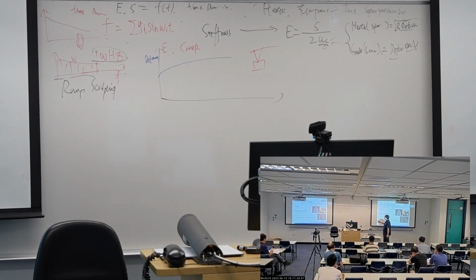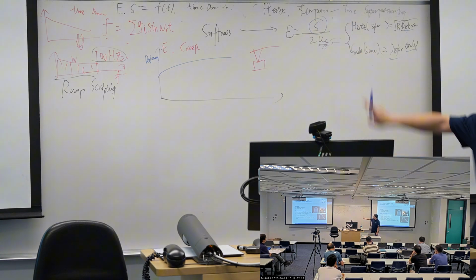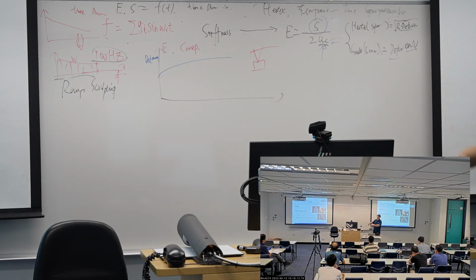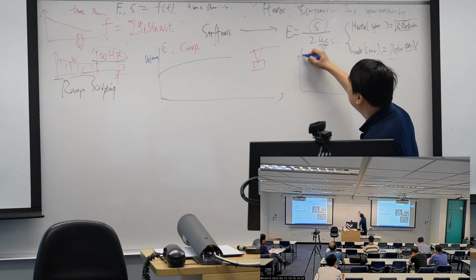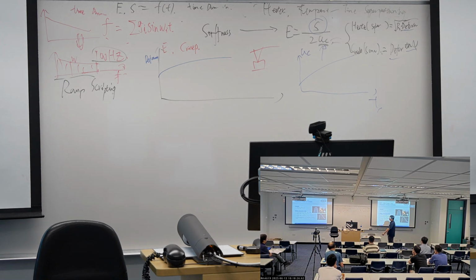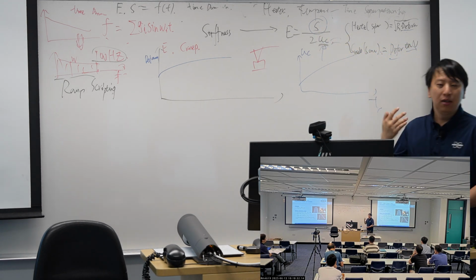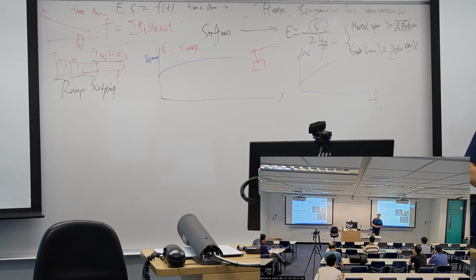So once the contact radius changes, we are actually measuring the stiffness. So we need to figure out how the contact radius changes against the time. Ideally, we want to get the Ac against time curve, and then we can get the modulus correctly. If we stay at the stiffness, it's okay. But we want modulus, so we need to get the contact radius out.